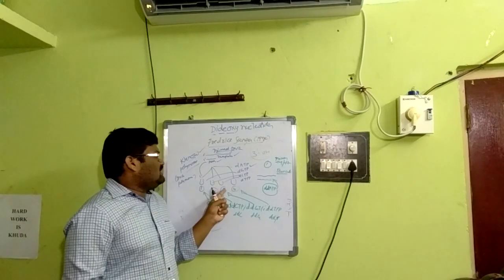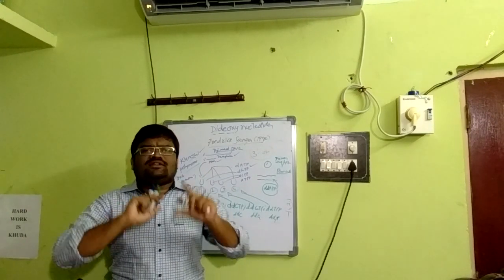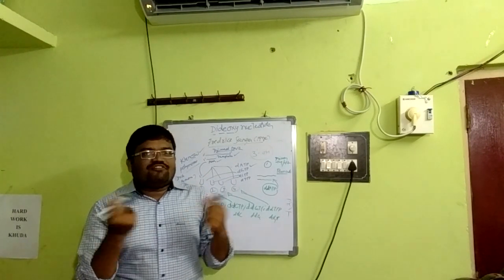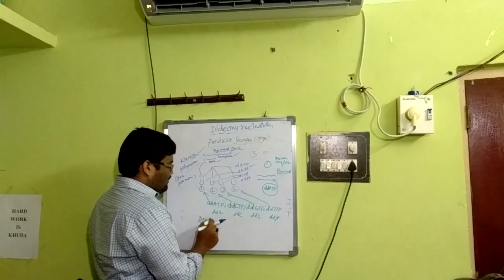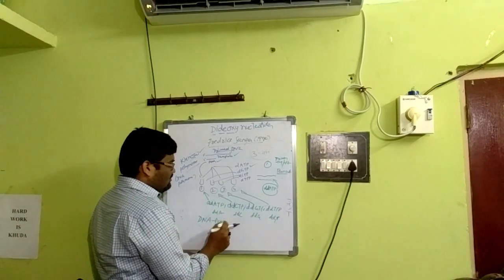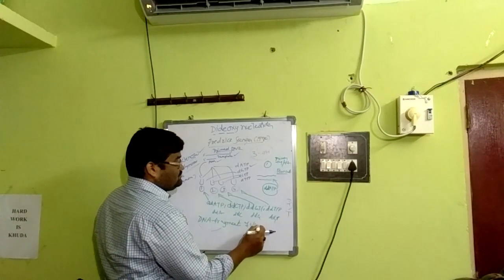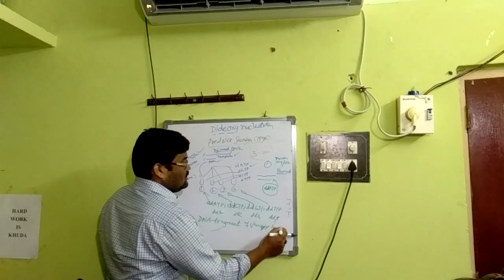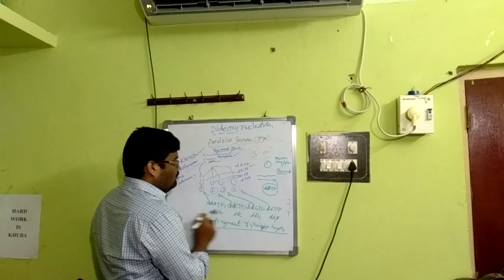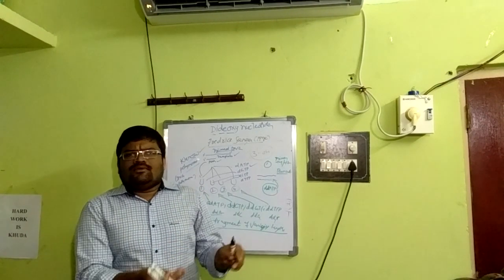The same action happens on the rest of the 4, that means the rest of the 3. That means it all together will create DNA fragments of varying lengths, in all the vessels. I will tell you how the sequence is determined. The rest of the process is the same.